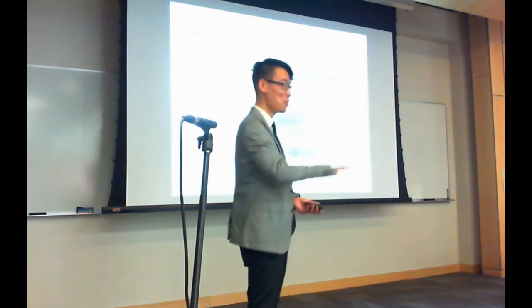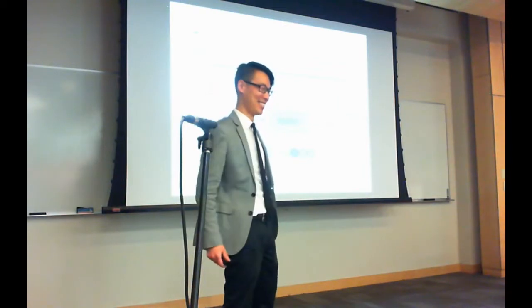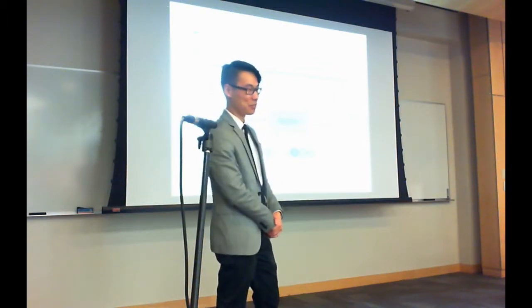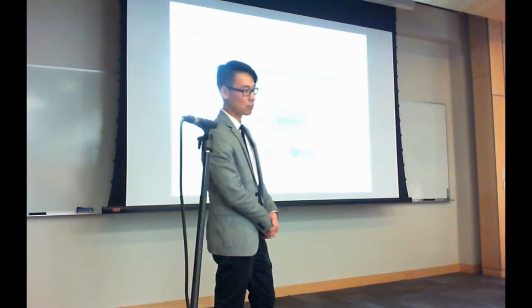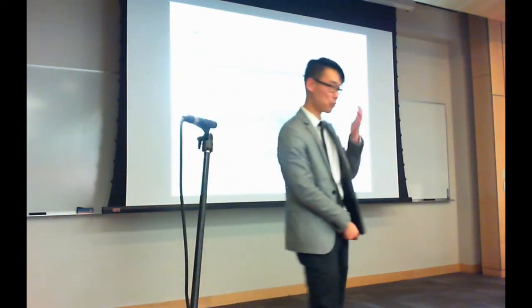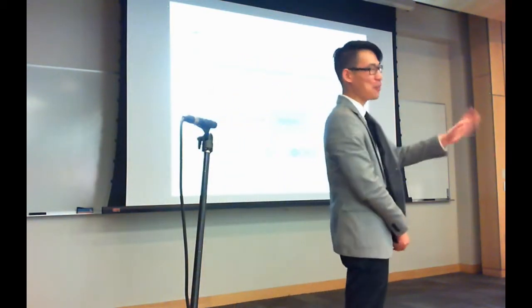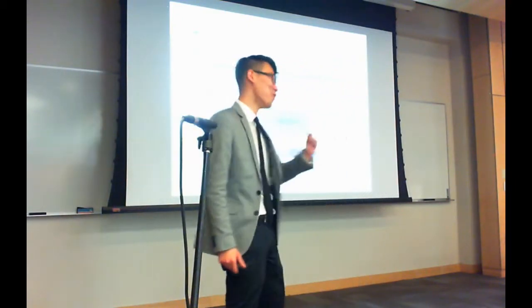Don't be shy if you're not convinced, Pavel. I'm not convinced, because in the end you can combine all spectra into a single data set, run MS-GF+ on them, and set up whatever threshold you like on this data set, let's say 1%, and then declare your spectral library to have 1% false identification. Well, that's what we eventually do. There's other things we do, but let's move on, and we'll come back to this.